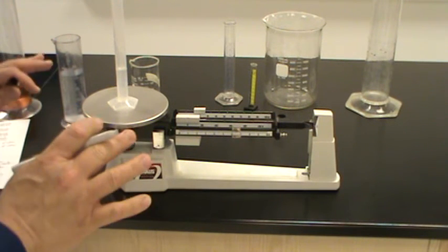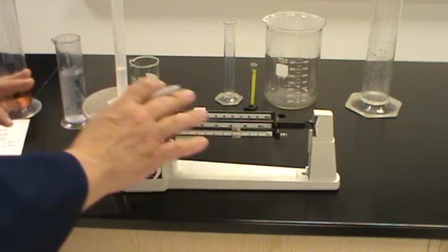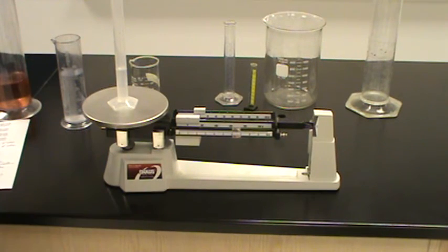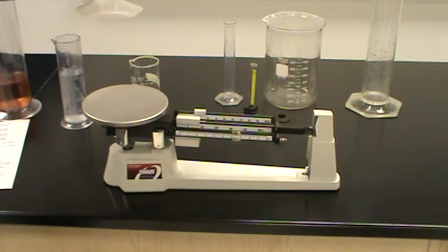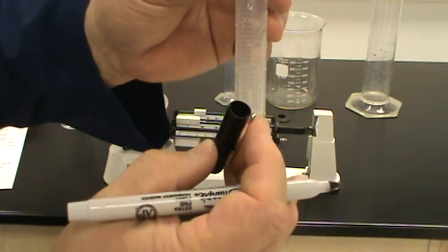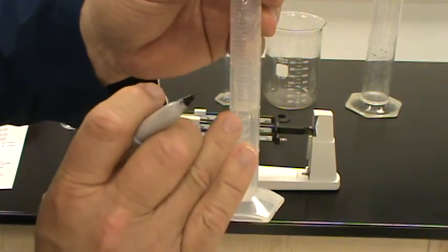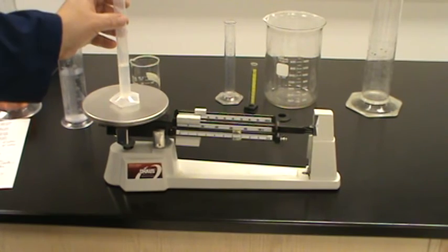We can conclude that 1 milliliter of water does weigh 1 gram. What happened in our experiment? We don't know. Probably what happened was, when I put the water in this graduated cylinder, I still needed about 3 drops of water to get the bottom of that concave at the line. But we are close enough.